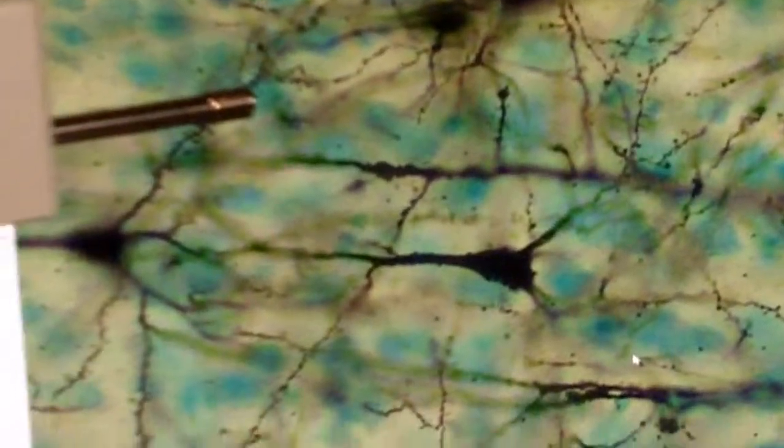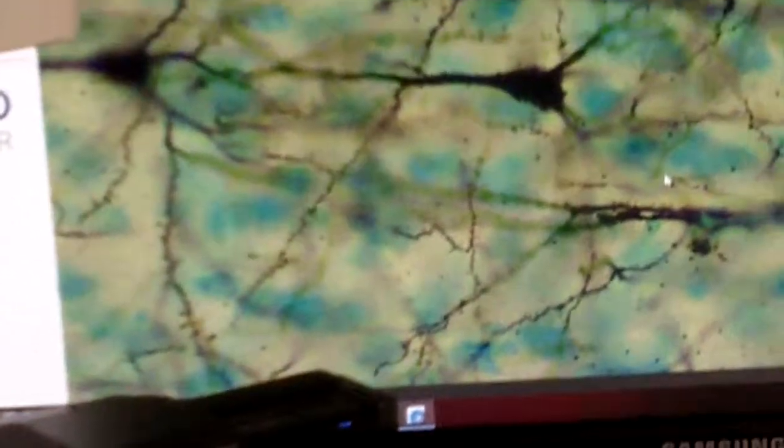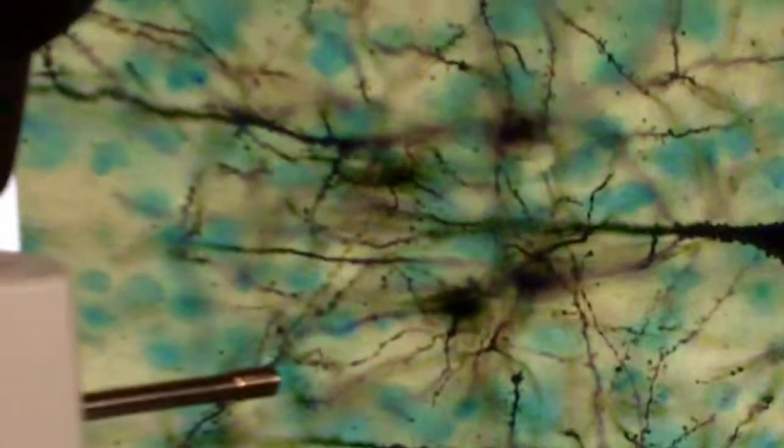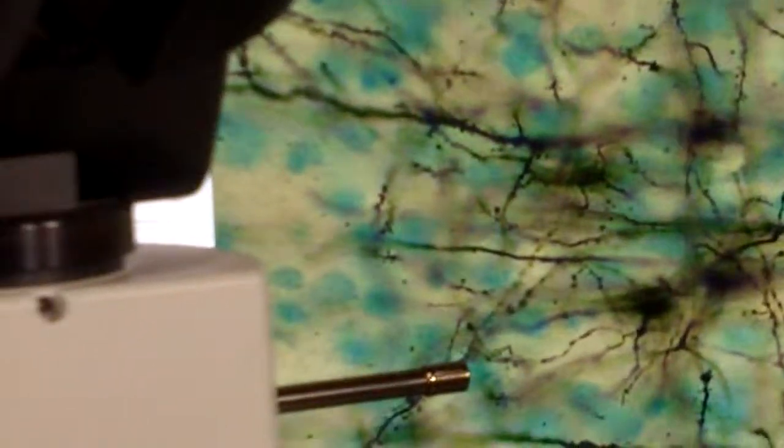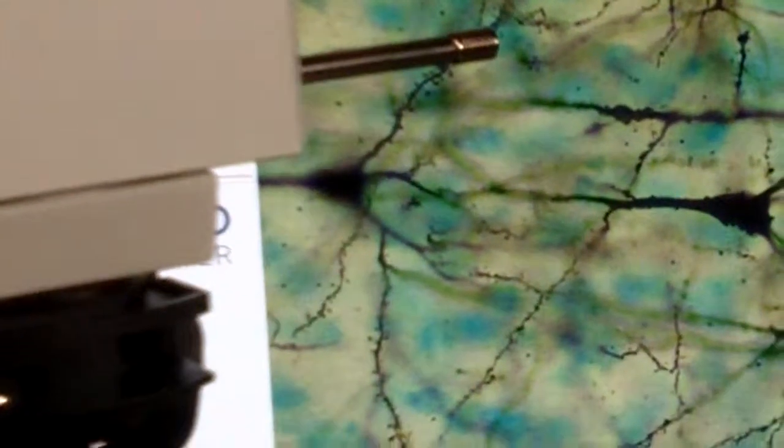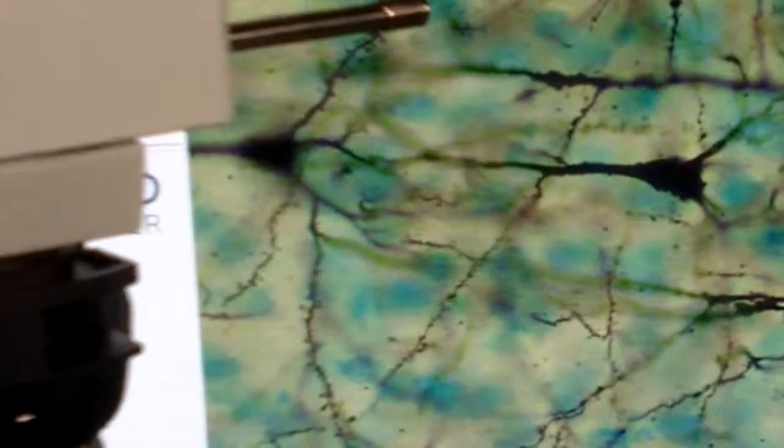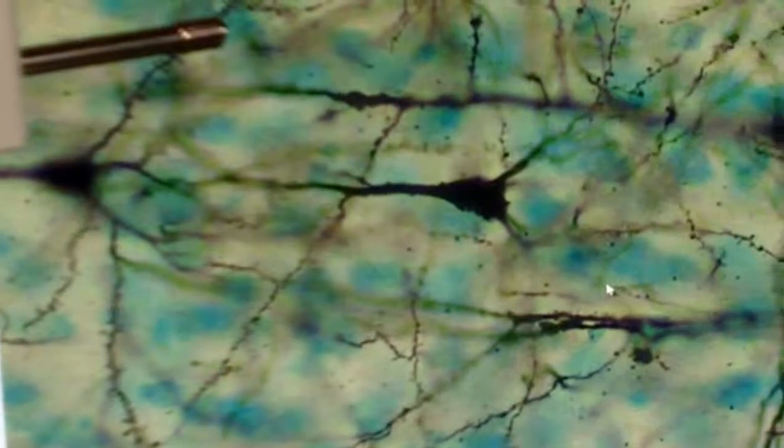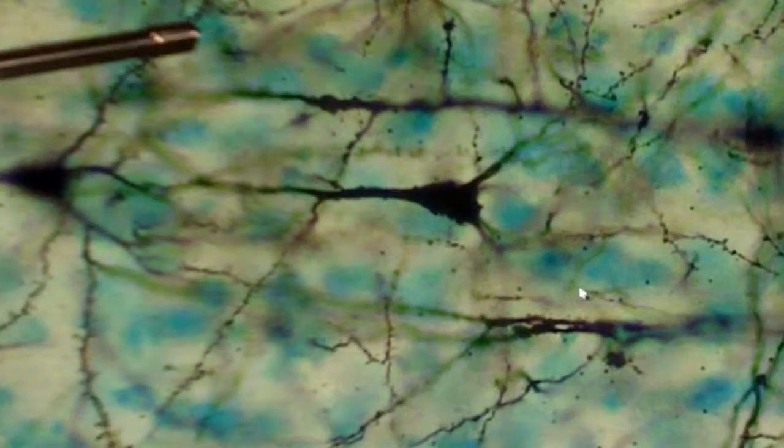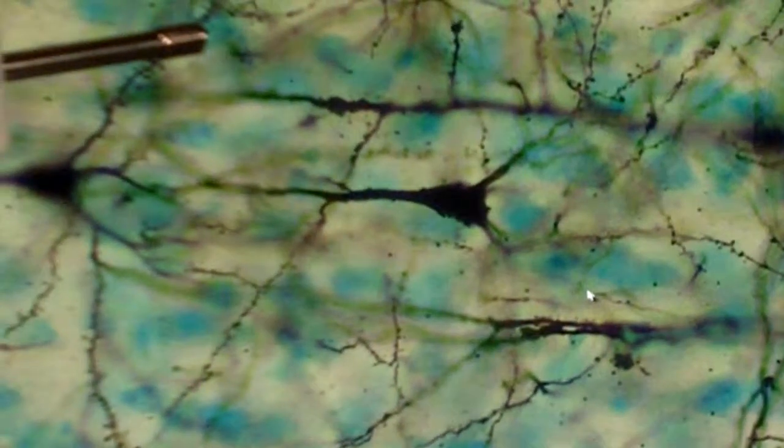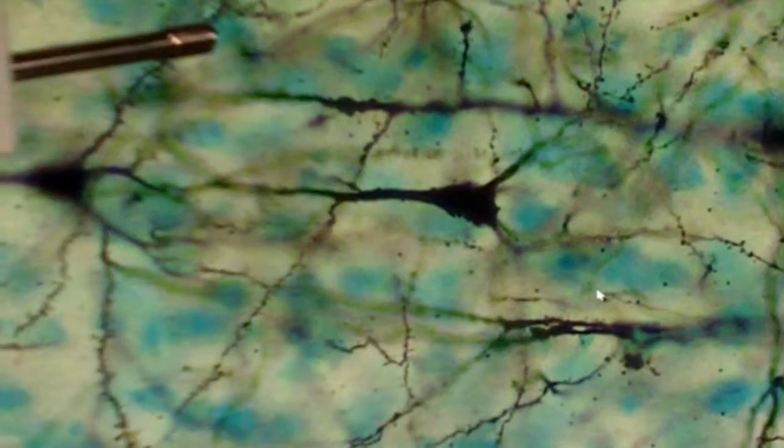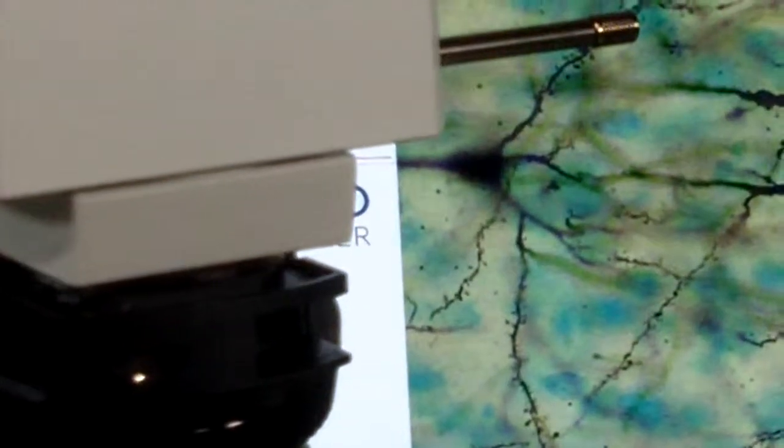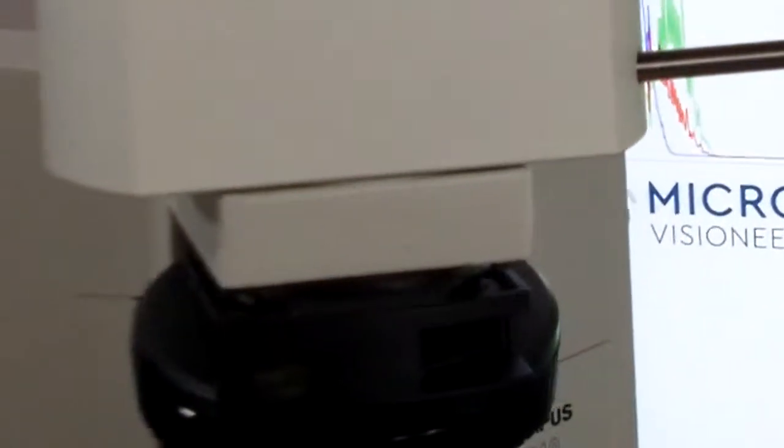Now we don't have the ability to show you the stacked image because we're not in live view and we don't have it going through the computer. But had you had this connected to your computer with Helicon Focus or the other software that we use, which is called Zerene Stacker, if you had either one of those, you'd be in good shape.